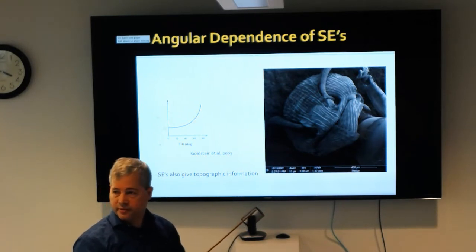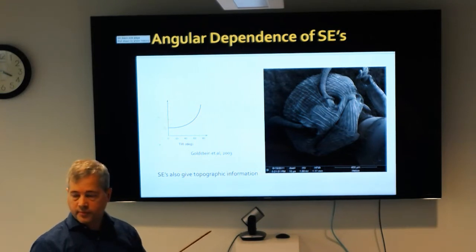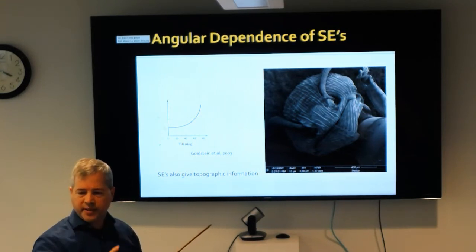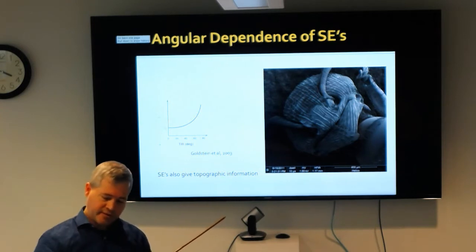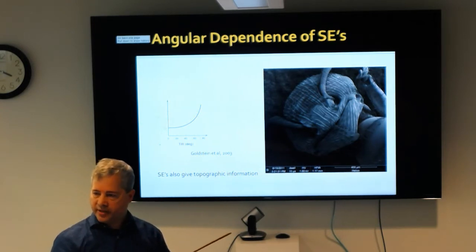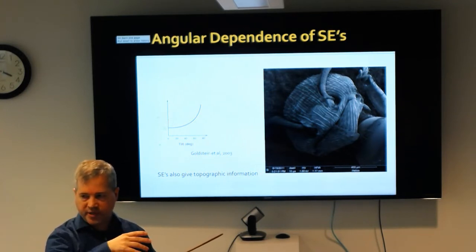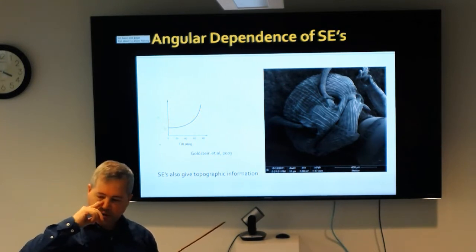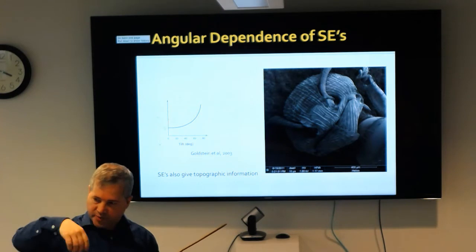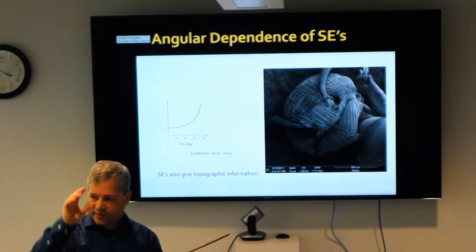It won't look very good. Is the metal coating process the same process as the gold plate coating process? The gold plate coating process that we use for grids, we're actually evaporating gold onto it, so you're heating gold up a lot, and then it lands on it. What we do is just sputter coating. It's in a high vacuum, but not as high as for the gold evaporation, and then you have a charged plate in an argon atmosphere, and the argon hits the charged plate, which has metal on it, and that causes the metal to sputter off and land on the sample.